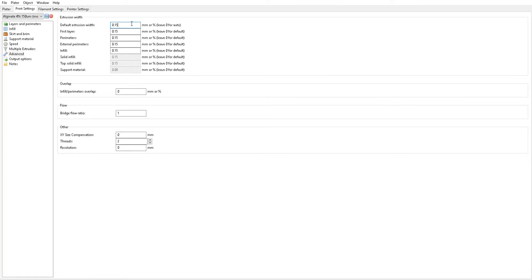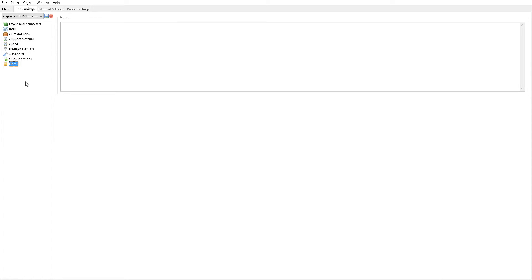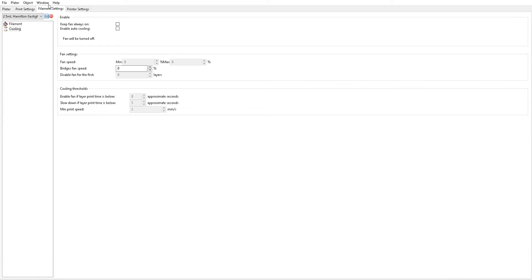Advanced. Again, I said that we were using a 150 micron needle and everything here just reflects that. So we're going to have 0.15 millimeters for everything. If I already use a 0.4 millimeter syringe, this would do all this, or 0.4, yeah, everything would just be 0.4 as well. So nothing else changes here as well, so no more output options that you really have to be concerned with and no nodes.